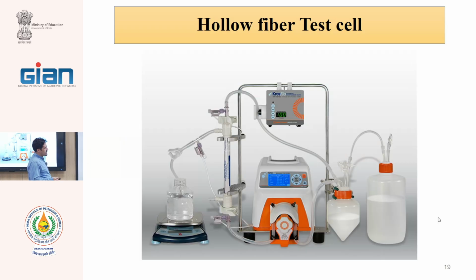Such as the flat sheet setups, we have a permeate tank, we have a feed tank, and usually we use the peristaltic pump for applying the pressure. This shows the flow of this solution. And here we can see the applied pressure.